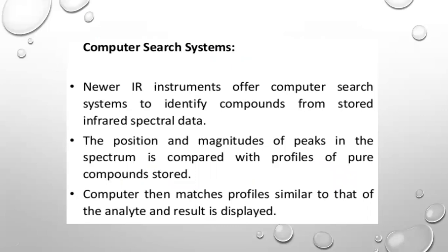Computer search system: nowadays all the spectrophotometers are generally software oriented, and these software packages have some libraries.